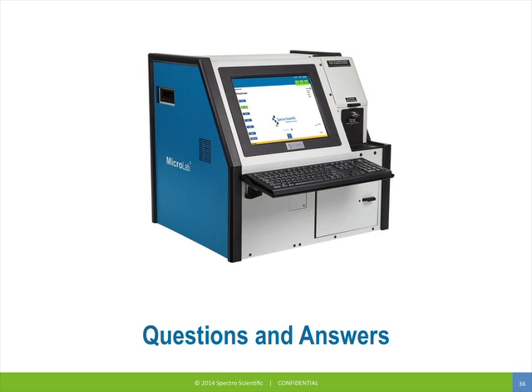Another question is, what's the repeatability of the MicroLab, of course, across all those tests? I mean, we certainly have it on a spec sheet, but perhaps you can comment in general. Yeah, the repeatability is... I certainly think one of the things that we look at with the MicroLab isn't necessarily comparing directly to laboratory testing, but whether the data that comes out is good enough and repeatable enough for the rules engine to do its job and give you the proper maintenance recommendation. Yeah, most definitely. The repeatability is over par for that. That's definitely used in all the rule statements, the trending and all that stuff that we use. It definitely is worked in there.